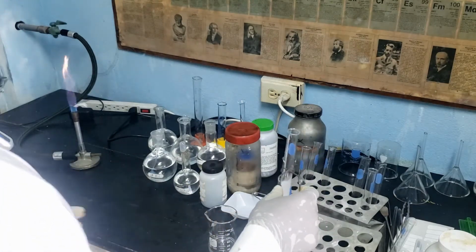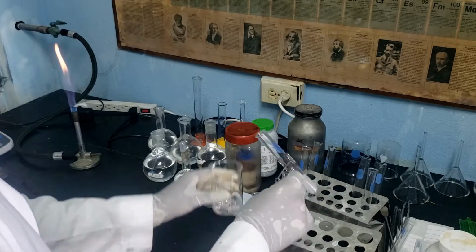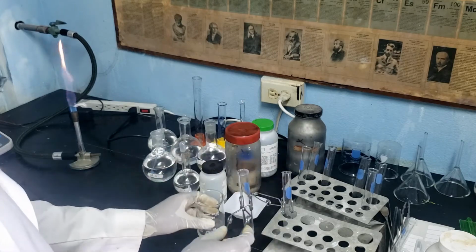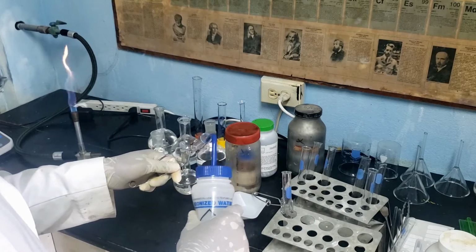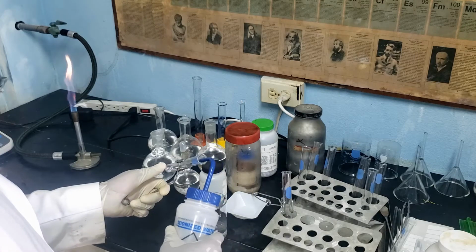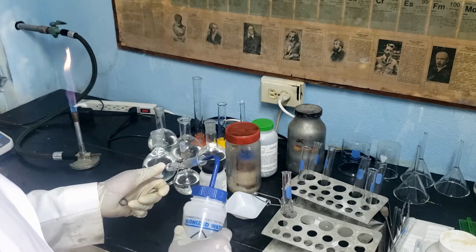By washing one sample with water after removing the acid, the oxide layer is allowed to reform once again, producing that protective layer. Aluminum metal quickly reacts to the oxygen in air to reform that aluminum oxide layer, making the metal seem unreactive.